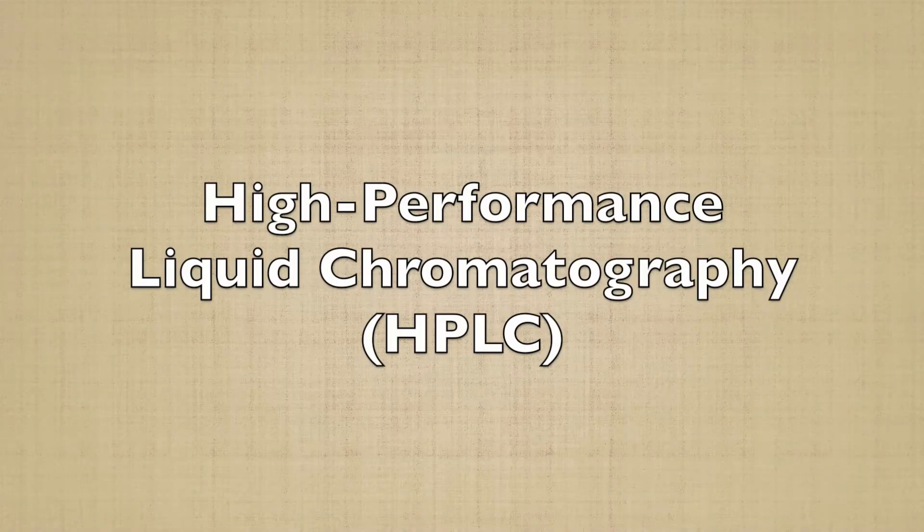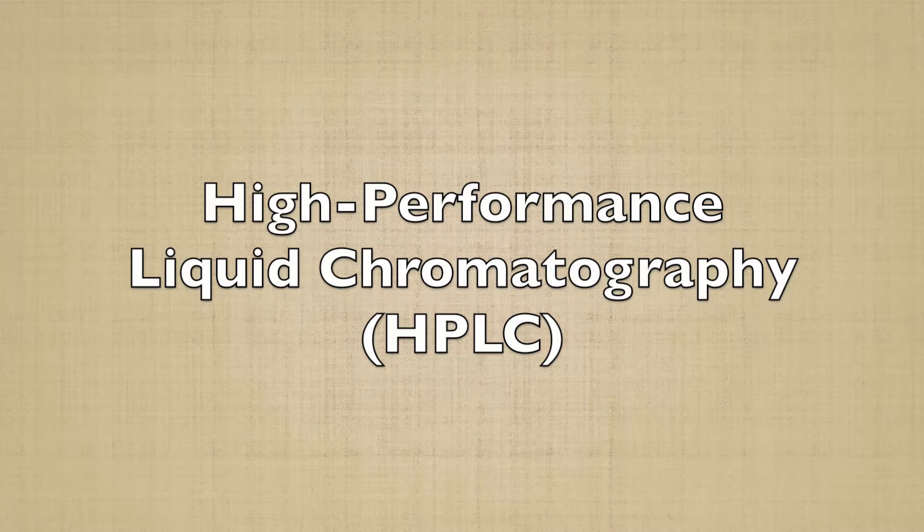This video will show you how to operate an Agilent 1100 series HPLC high-performance liquid chromatography system.